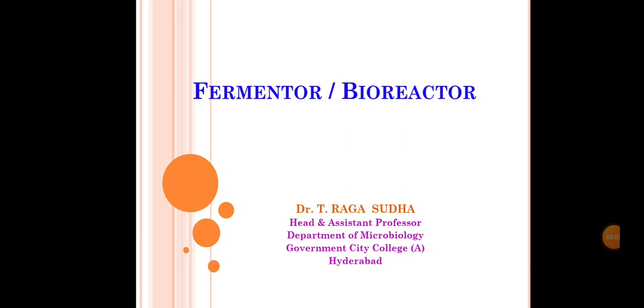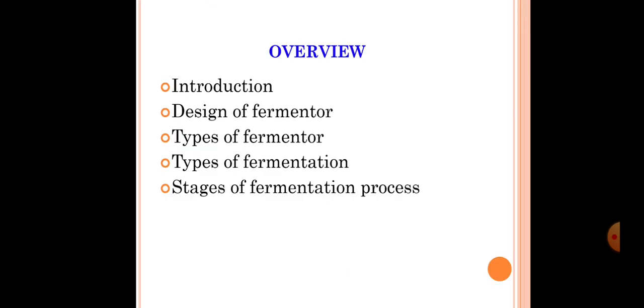Good morning, students. Myself, Dr. Ragasudha, Head and Assistant Professor, Department of Microbiology, Government City College, is here to talk on fermentor or bioreactor. Overview: introduction, design of fermentor, types of fermenters, types of fermentation, stages of fermentation process.